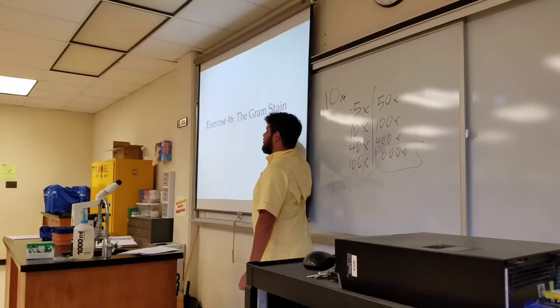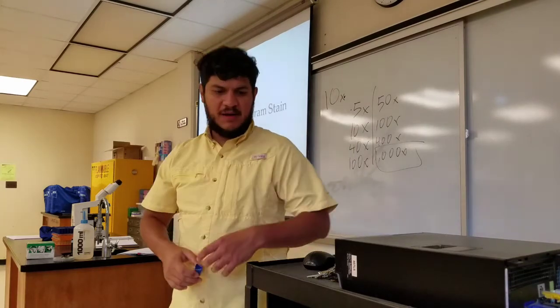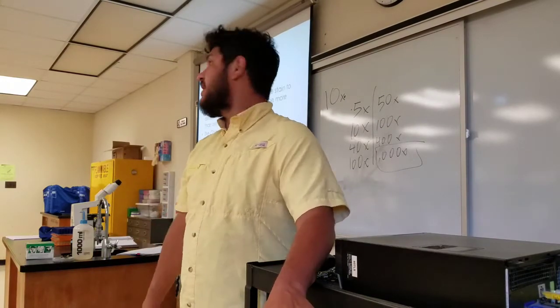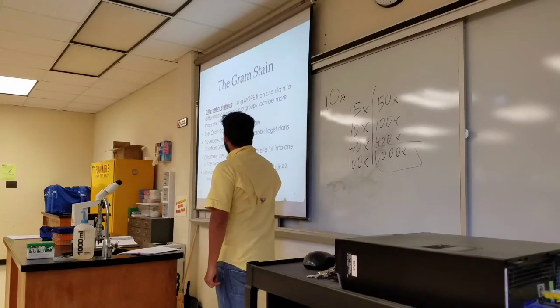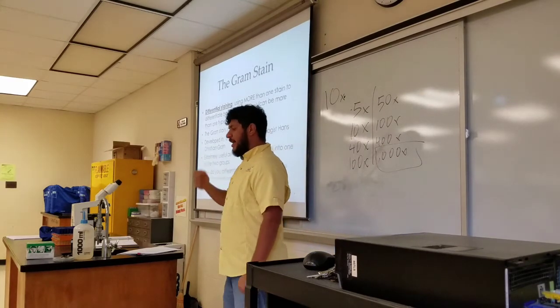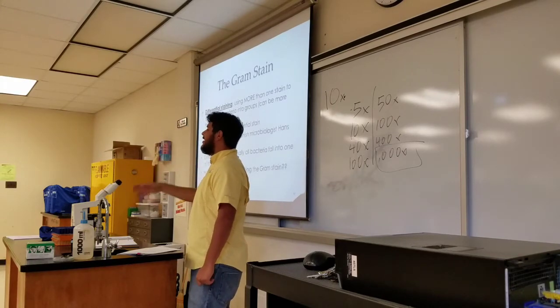We're going to go through more specialized staining techniques than we use. The most widely used probably is the gram staining, and I bet if you hear anything about bacteria, you might have heard the terms gram positive or gram negative. Now, gram staining was developed in 1884 by Hans Christian Gram, and it is very useful to differentiate between two types of bacteria, gram positive and gram negative.